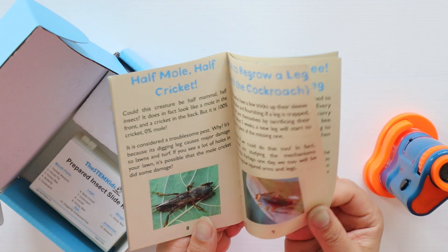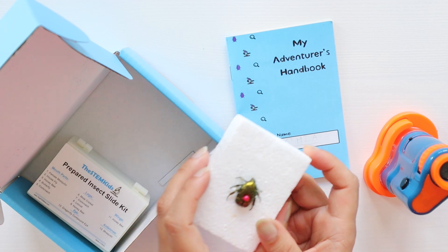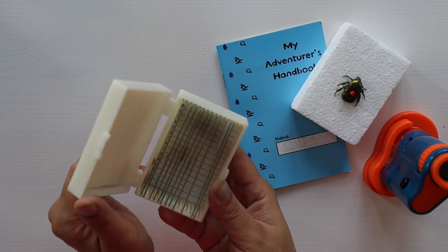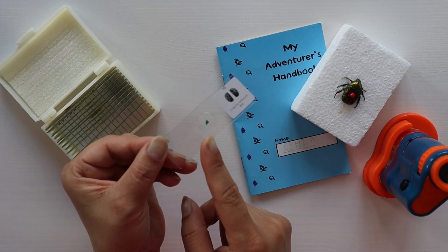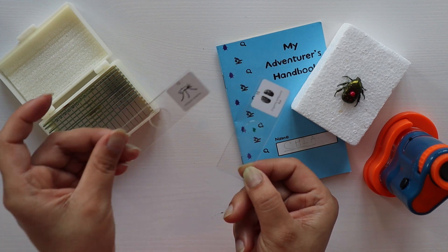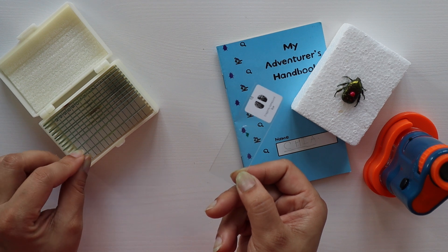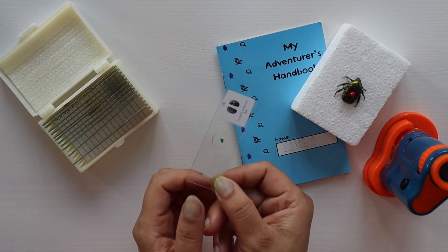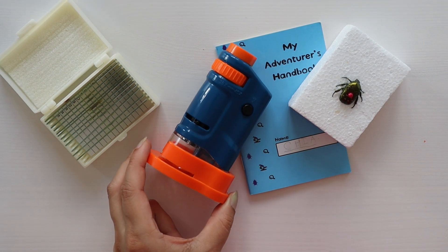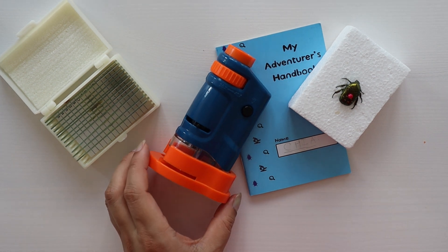If you like, you can also buy this ready-to-discover kit, where you will get a mini adventure handbook with different insects mentioned, a beetle sample, and an insect slide kit with 12 slides — like the dragonfly eye and mosquito antenna. This is a great way to keep your child busy, especially during summer break. I'll provide the link to their website in the video description.